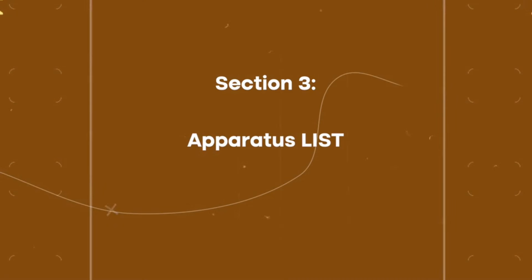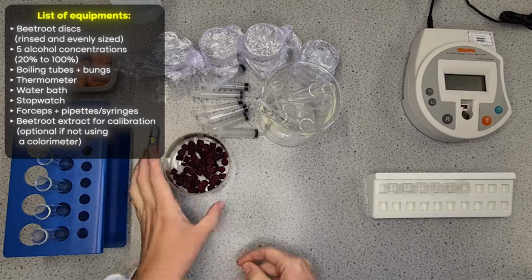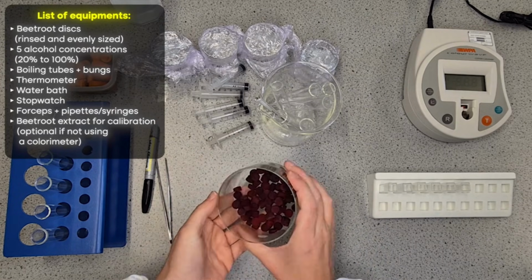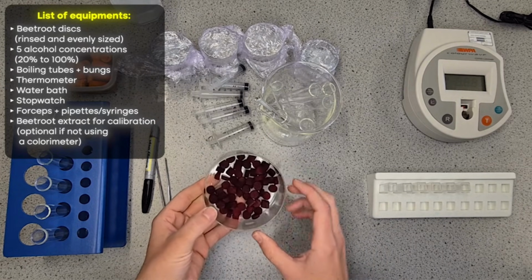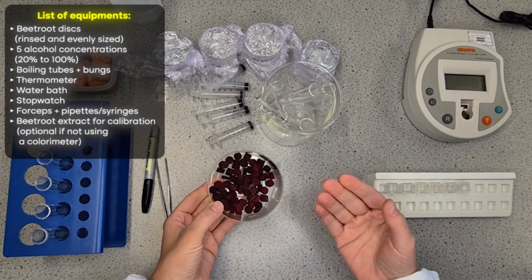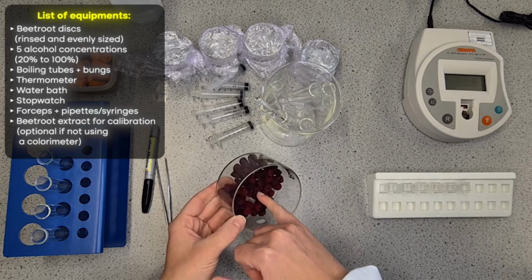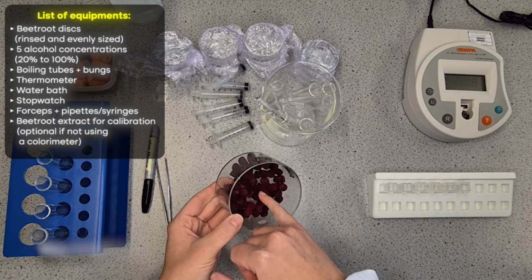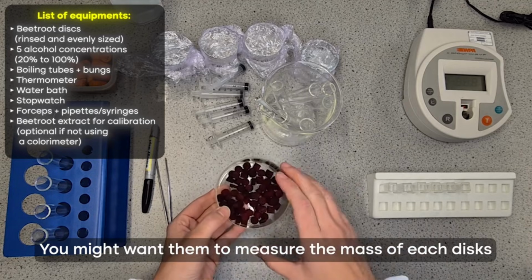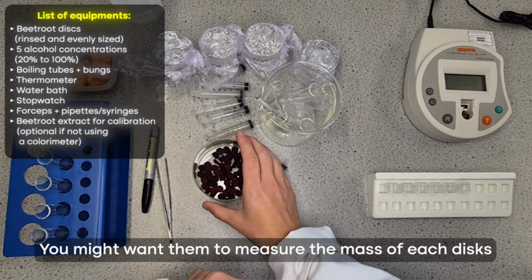So here is the equipment that I'm going to be using. So we've got the beetroot, which is already cut up into discs. Now, in terms of control variables students need to be aware of, they should be using the same beetroots, and therefore we know it's the same species, the same age, should be the same size and shape discs, but you might want them to measure the mass of each disc before we put it in as well, just to have that there as a consideration.